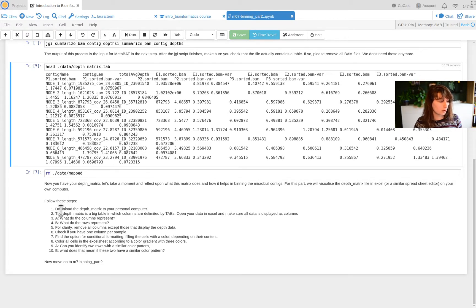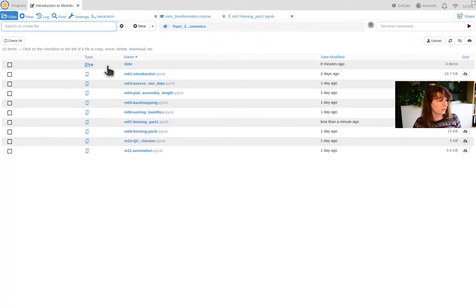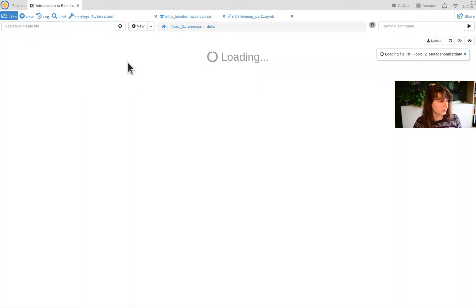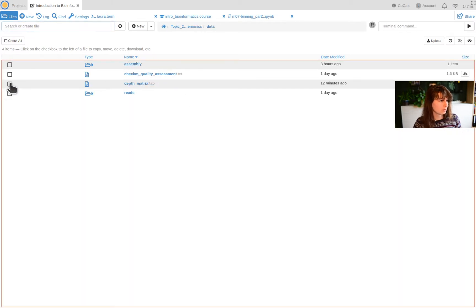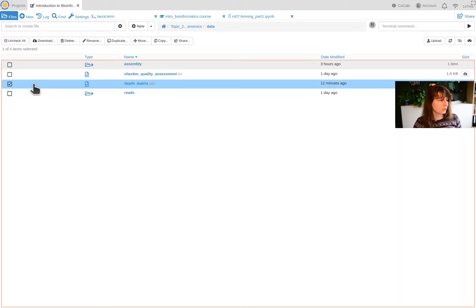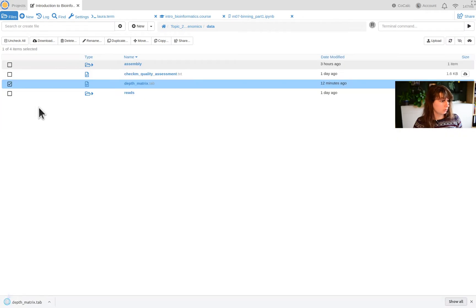We're going to follow the steps. We're going to download the daptmatrix.tab file to your computer. So I'm going to go to Files here — I've stored it in the data directory, daptmatrix.tab. I select it like this and I click Download. There it is.